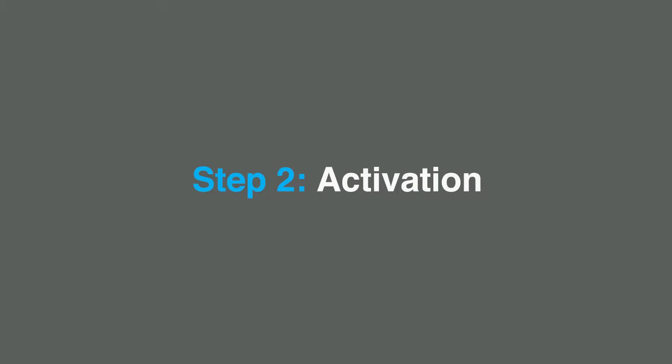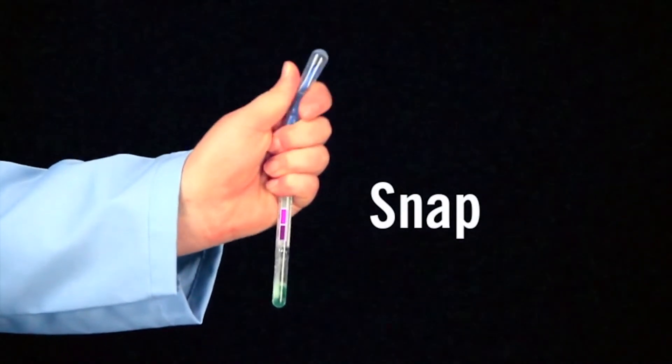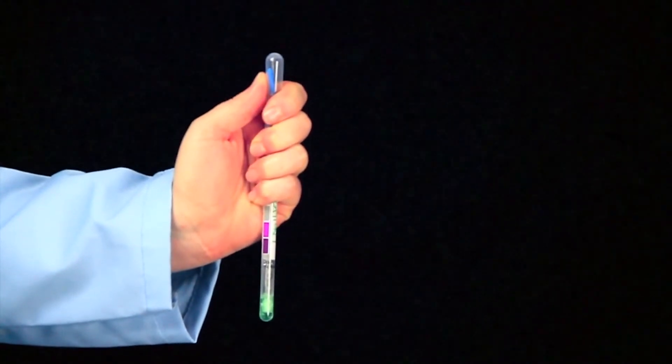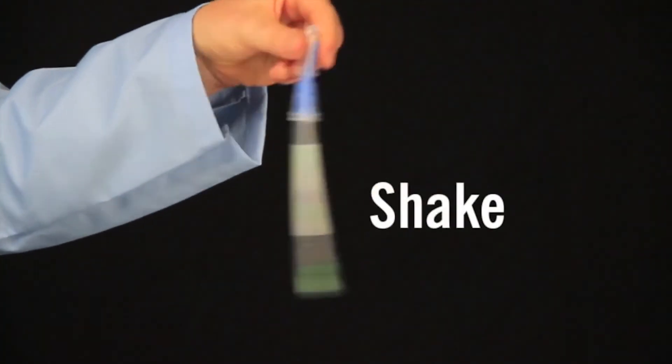Now replace the swab in the tube. Step two: test activation. The easiest way to activate the test is to hold the device in your fist and use the thumb and forefinger to break the snap valve, bending the bulb forwards and backwards. Next, squeeze the bulb to expel the liquid into the tube. Then shake for five seconds.